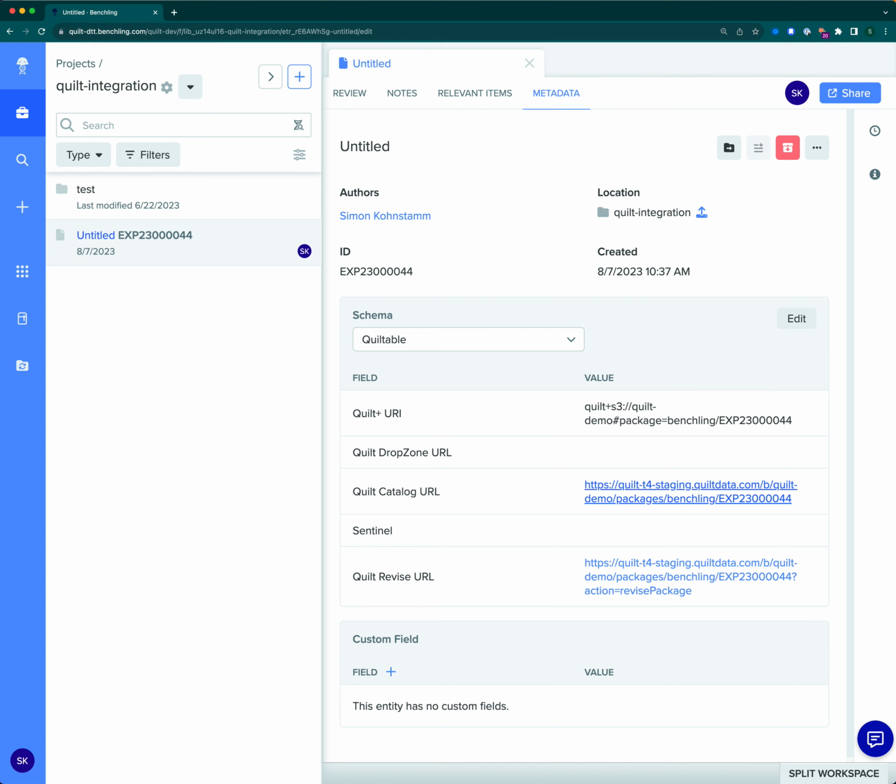So as you can see in front of you, you've got a Benchling notebook that I created yesterday that has the schema that right now is what we're using to link up Benchling and Quilt. You release a CloudFormation template that installs the integration, and then based on these fields, the integration knows to link the two systems together.